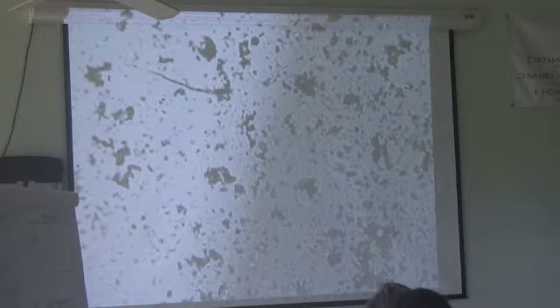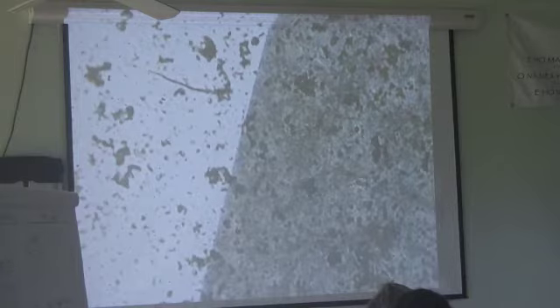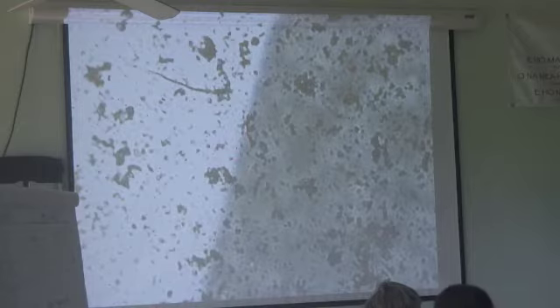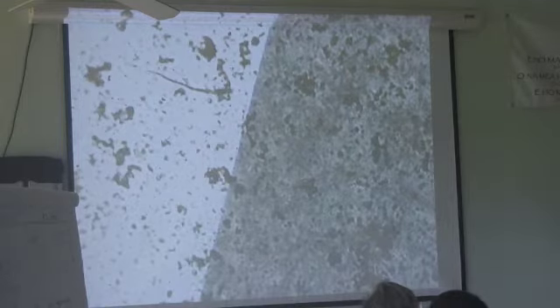Condenser knob, you're going to focus on that edge and that piece of paper, so my little left red line is pointing. Thank you, David. So see how I've gotten it as sharp and focused, so there's a little longer focus, here it comes, nice and focused, and then I go over focus. I want to go right there, where it's nice and sharpest.